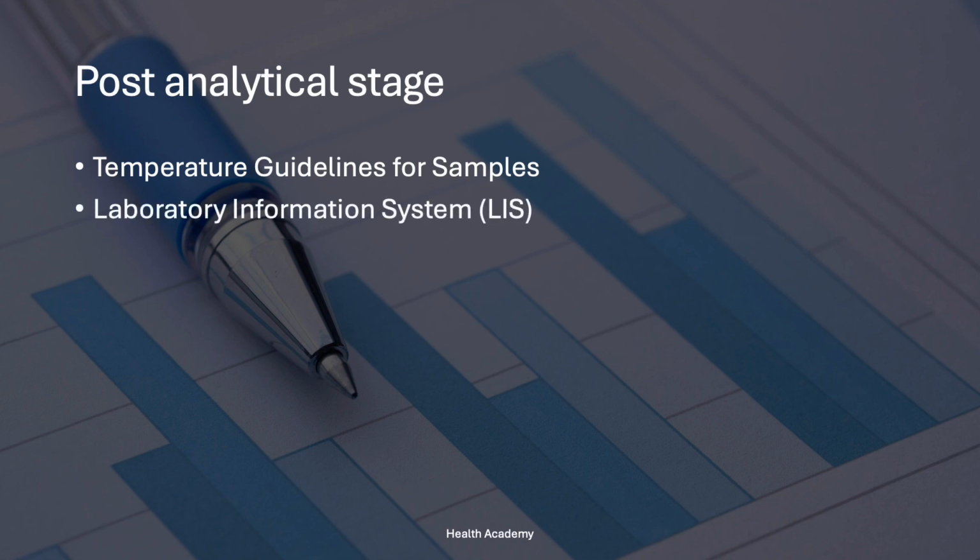Laboratory Information System, in short LIS. Use an LIS to effectively manage, archive and retrieve results and laboratory information. Critical Results Notification. Quickly inform the relevant medical staff about critical results, maintaining a systematic feedback loop and documentation.